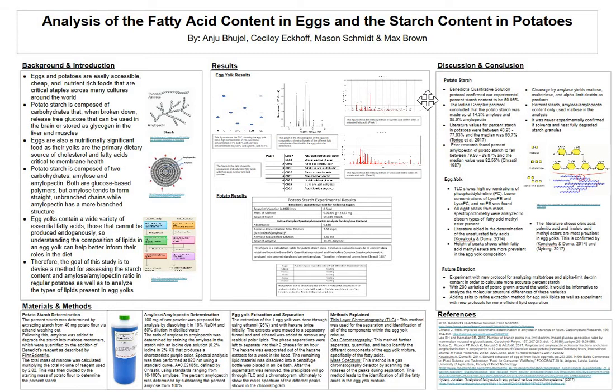So going first with the saturated fatty acid, we would take the highest peak mass, and that would be the mass of the entire fatty acid. Then we would subtract 74 from that to account for the methyl ester. And then we would divide by 14 because we need to account how many CH2s were in the fatty acid. That is the key in determining what the fatty acid was.